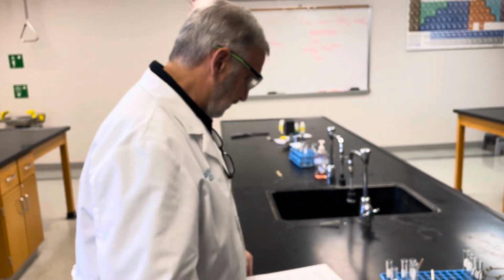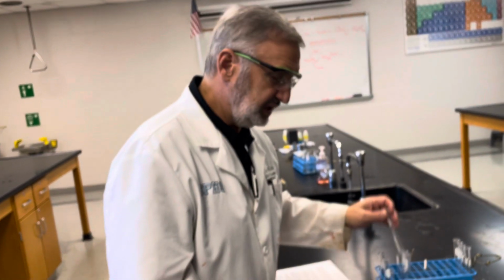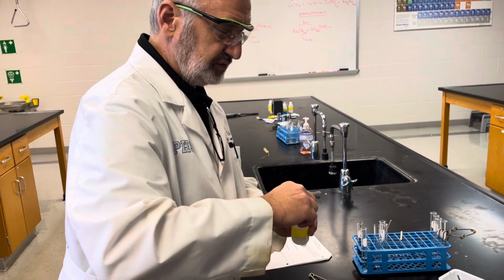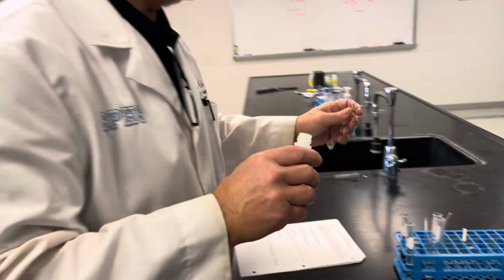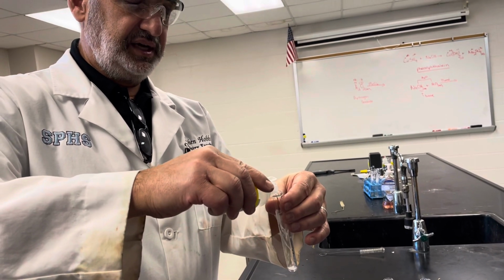So then we go to the fourth reaction, which is we want to take another test tube and put some HCl into it. So I'm just going to save some time and pour some HCl. Let a little bit of water out of there. Some HCl.